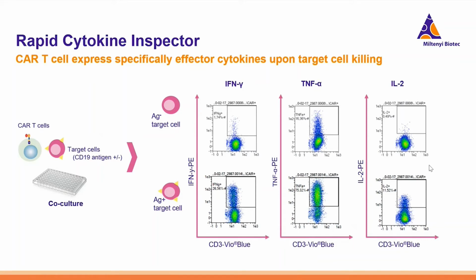Co-culture of CAR T cells with antigen-negative target cells did not lead to a proper T cell activation, with no or only low cytokine expression. Whereas co-culture of CAR T cells and antigen-positive target cells, as you see here, led to strong expression of interferon gamma, TNF alpha, and interleukin 2.